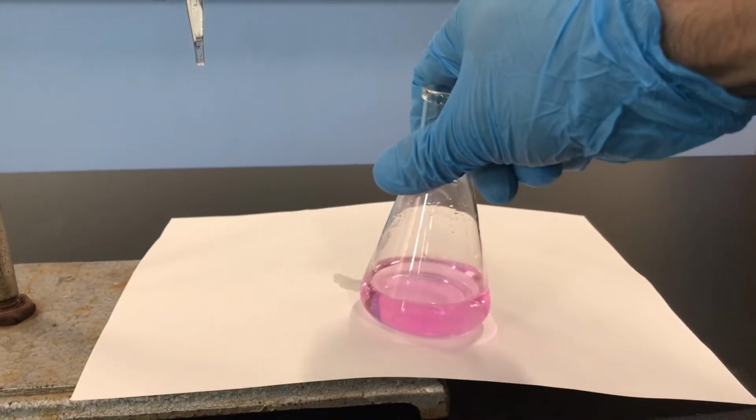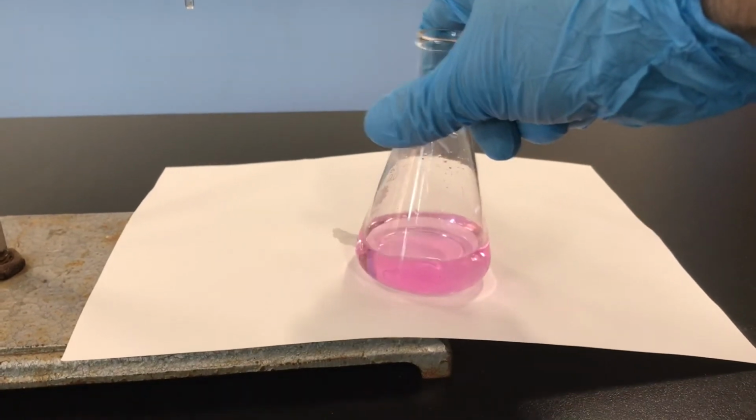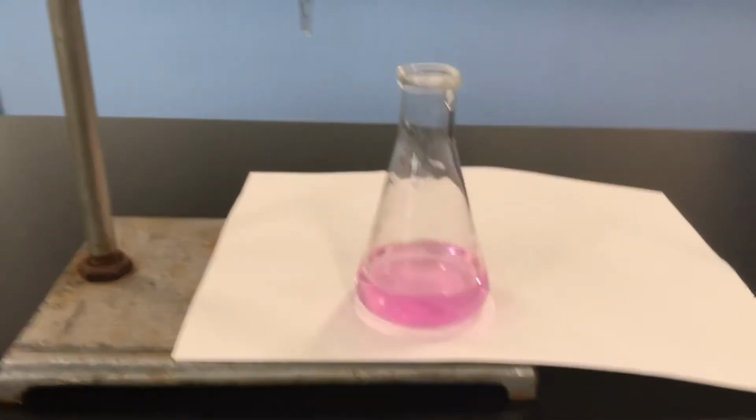We can see it's faint pink against the white piece of paper. And our final reading on the burette is about 17.7 milliliters. Final reading on the burette, 17.7 milliliters.